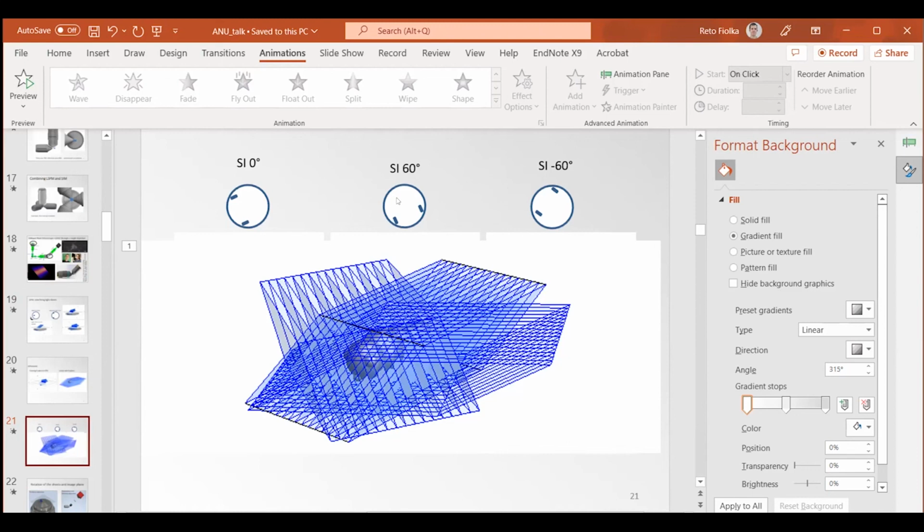I think TIRF will be more sensitive. If you have a little angular error, you will probably see it because the penetration depths would jump around. So maybe one could do it, but I think it will push it even more in this application. Thanks. That makes sense.